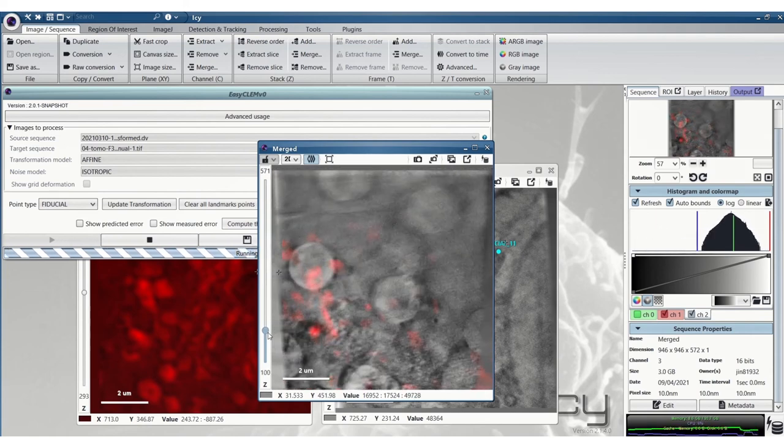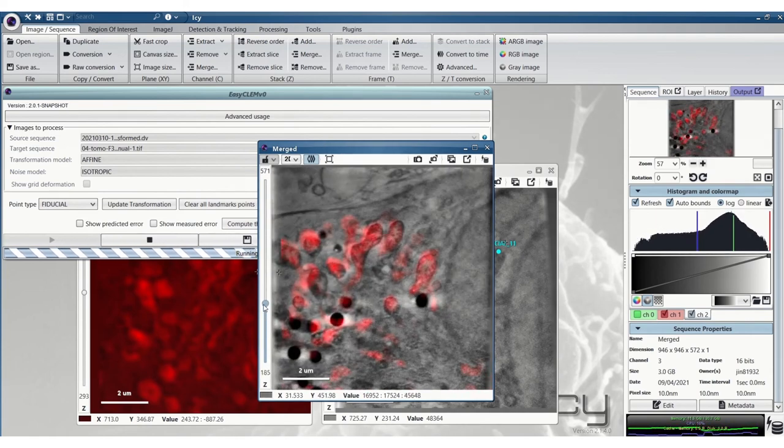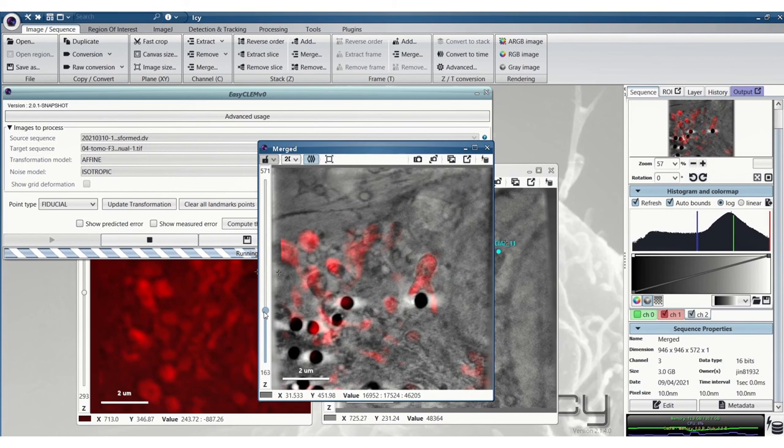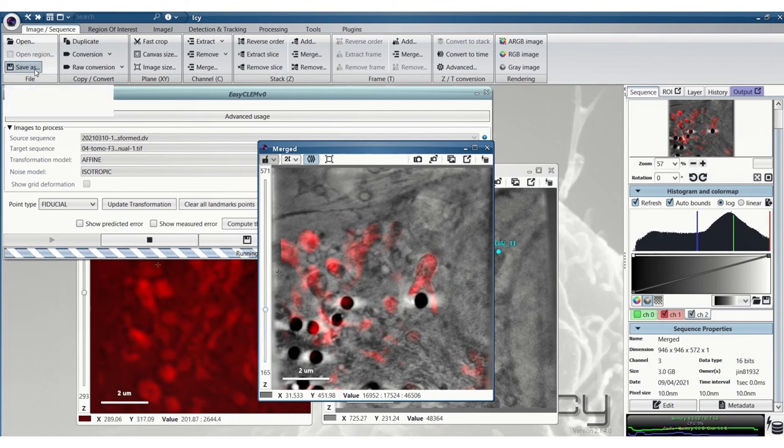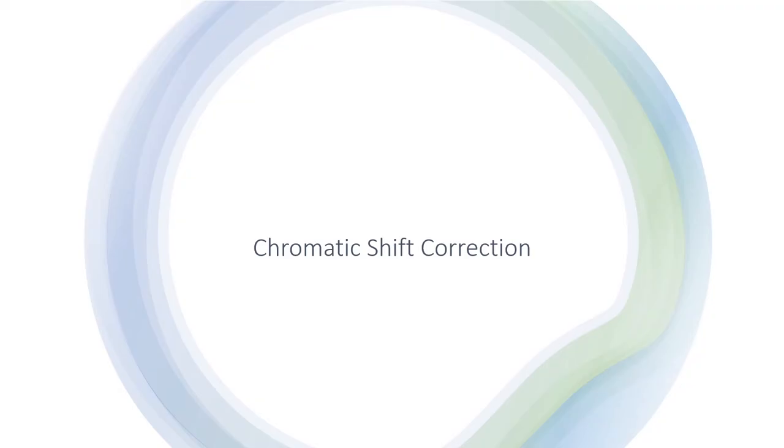We can now save this merged image or we can just save the transformed sim image and merge them in another software like Fiji, for example. So that's the registration process. Now onto some extras.